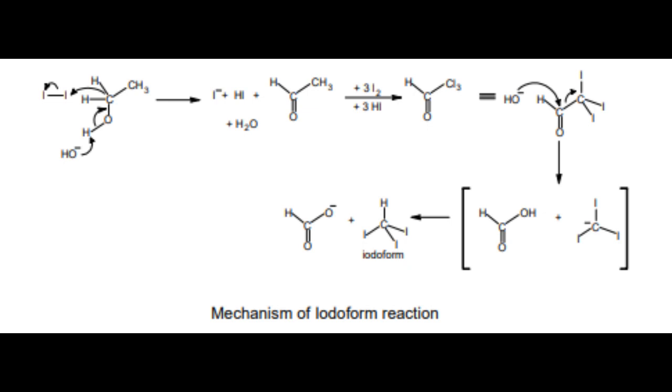D. Phenols. Phenols are weakly acidic in nature and dissolve in dilute sodium hydroxide, but are not soluble in sodium hydrogen carbonate, sodium bicarbonate. However, strongly acidic phenols such as 2,4,6-trinitrophenol are soluble in sodium hydrogen carbonate solution also. Phenols give the following tests.